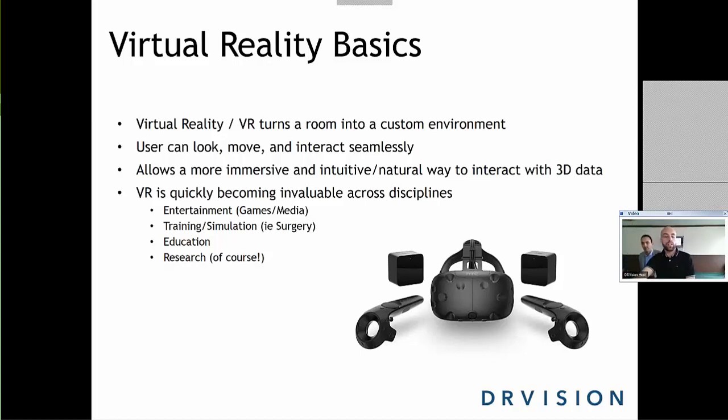So research, education, surgery simulation, if you're not using VR, you're kind of behind the times. Like it's here, it's now, it's good. And all of our team has been really hyped about it. So I'm just going to go on.